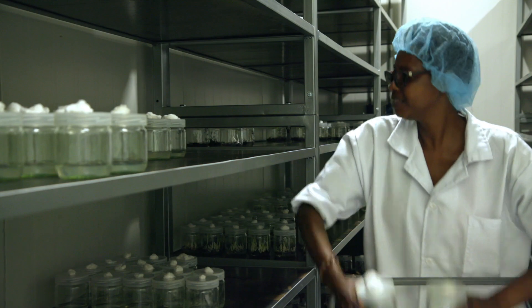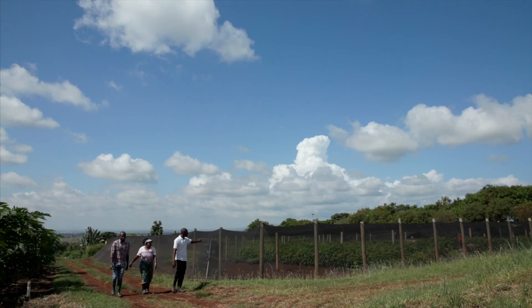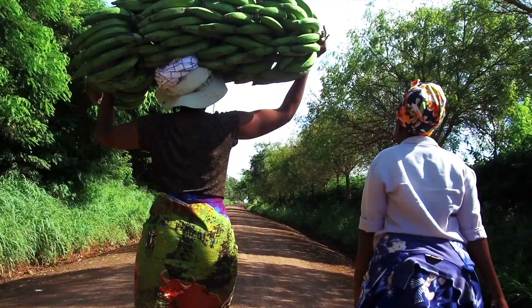After the plantlets have been rooted in the laboratory they are sent to our nursery. Here the primary and secondary hardening is done. The bananas are now ready for field planting, producing a superior harvest.